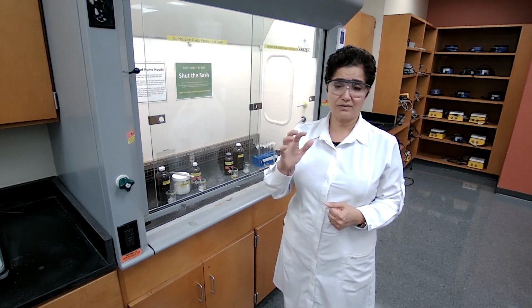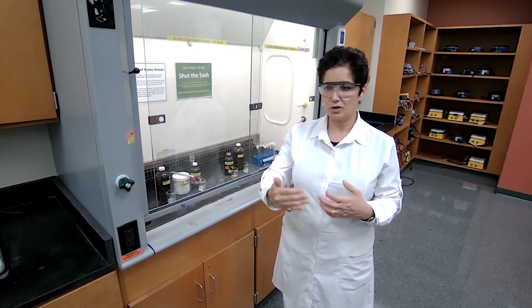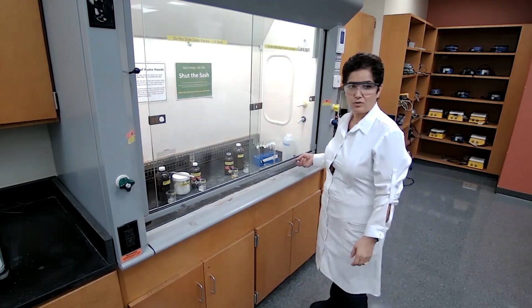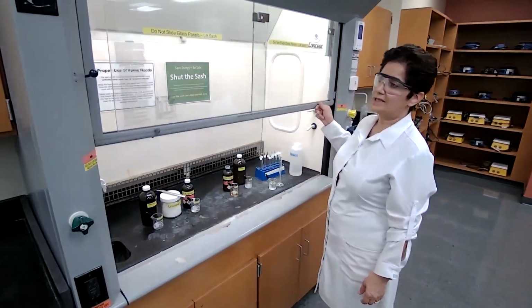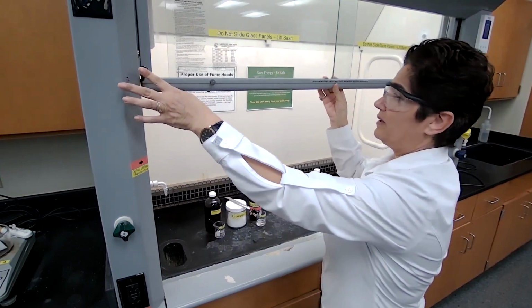If it doesn't dissolve in water and doesn't dissolve in HCl, then we test for sodium hydroxide, which I'm going to explain one step at a time. But first, we are going to determine the solubility in water of the unknowns that we have.